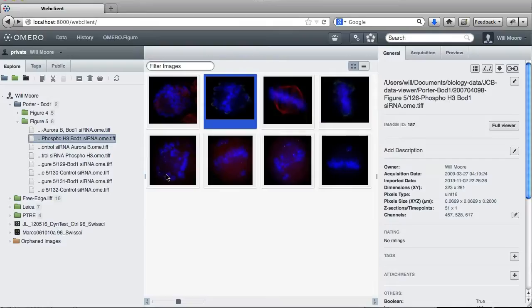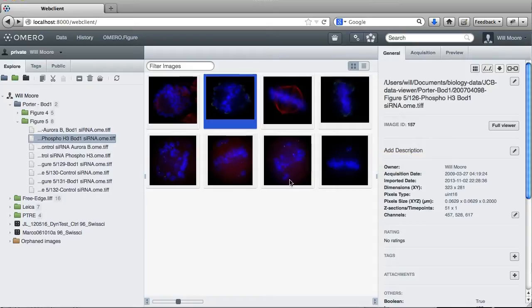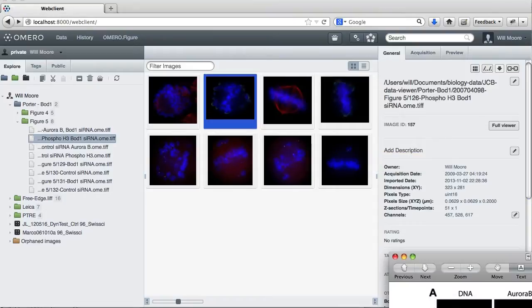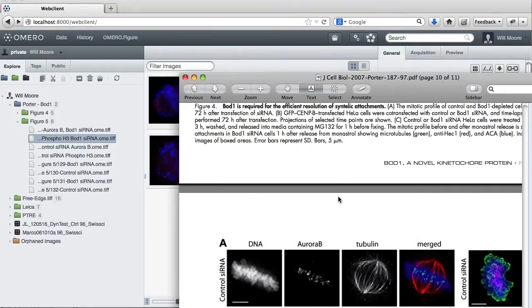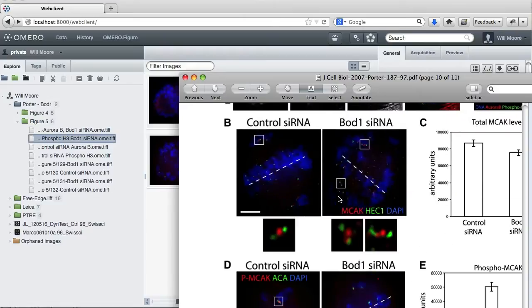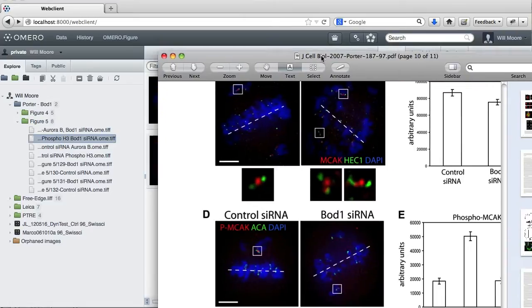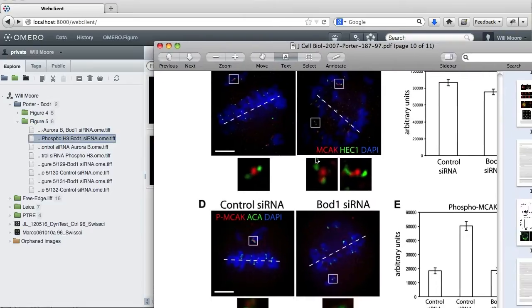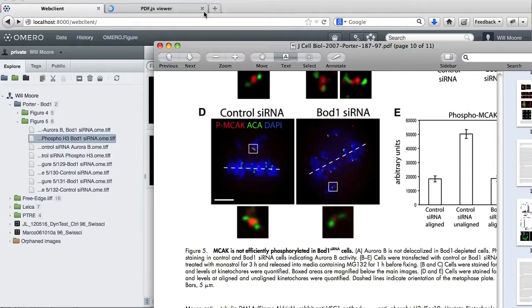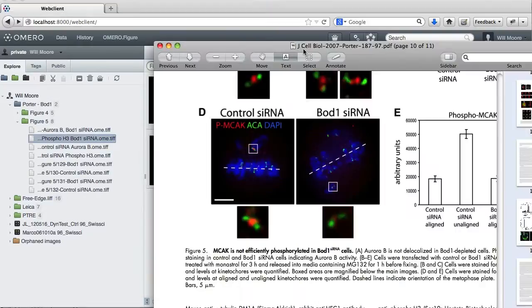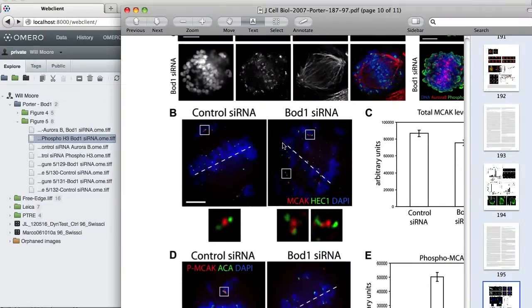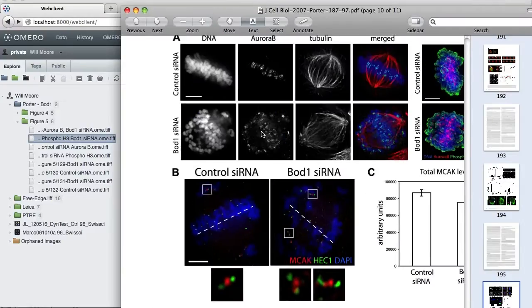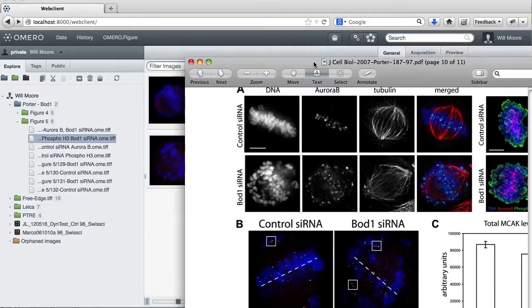These images I've actually downloaded from the JCB Data Viewer website and they come from a paper published in 2007 by Ian Porter on MCAK. So we're going to try and make this figure from the images we've downloaded, or at least start to do some of this figure anyway.